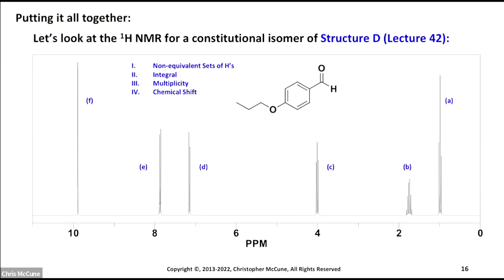Okay. So let's look at A and B. This is a great example of when you start removing hydrogens on the carbon and replacing them with other atoms, say like carbon, you start to become more downfield relative to the other. So if you compare this to this, that's a C with 3 hydrogens, this is a C with 2.